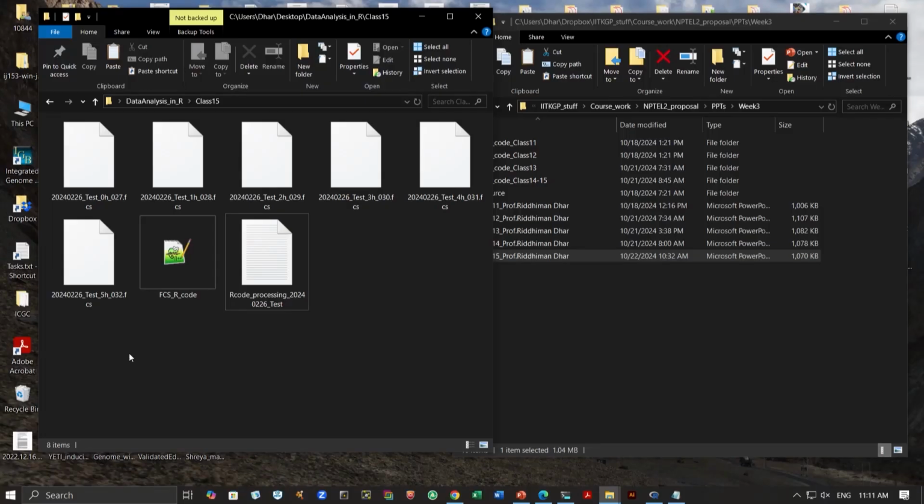Okay. And what we want to see is how the signal changes. So, this is the idea we have, and whether there are subpopulations that are showing change in expression of certain genes over this 5 hour time period. Okay. So, you might have very similar data. You might be doing some treatment, or maybe you are exposing them to different conditions and you want to see how gene expression changes, or maybe you are working with, let's say, an antibody, and then you want to see the subpopulations, etc. Okay. So, in this data we have both GFP and mCherry channels.